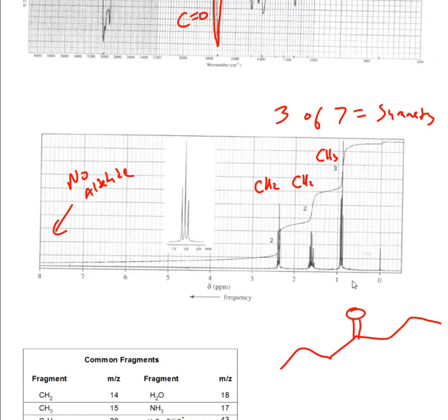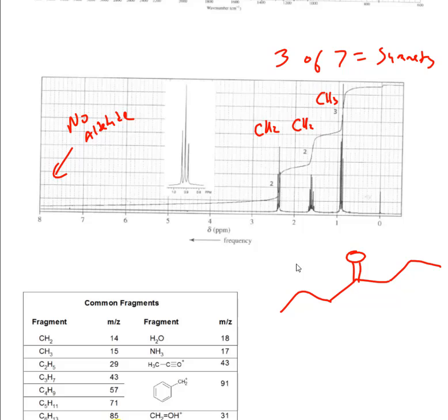I hope if you did my NMR work with me, then this was a joke. It's very simple to read this out, because you know carbonyl's here, whatever's next to it is right here, the first one up. Remember, when they zoom in like this, this is a zoom in of one of these readings, which it happens to be this one. Okay, so they're just blowing it up.